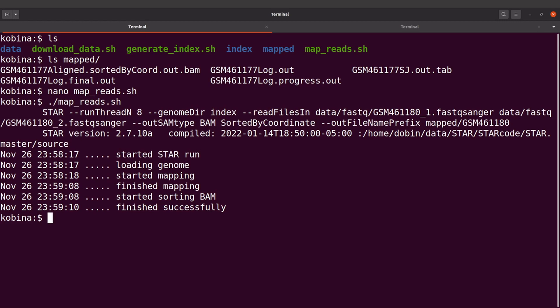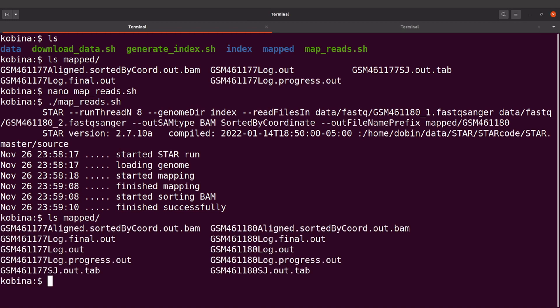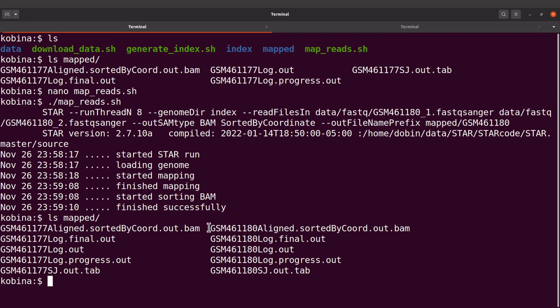STAR has completed mapping for the second sample. Let's check the map directory — ls mapped. We have all the output files here. We can differentiate them by their sample IDs.